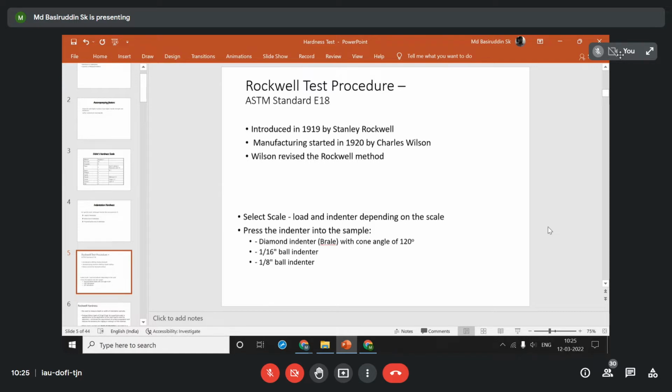In softer materials, obviously, the indentation depth will be much more as compared to harder materials. So if we carefully measure the depth of indentation, then based on that we can get a Rockwell hardness number. In general, when the depth of impression is high, we get a lower Rockwell hardness number. And when the depth of impression is low, that means we are getting a higher Rockwell hardness number. Now, by seeing the hardness number, we can differentiate the hardness of two different materials.